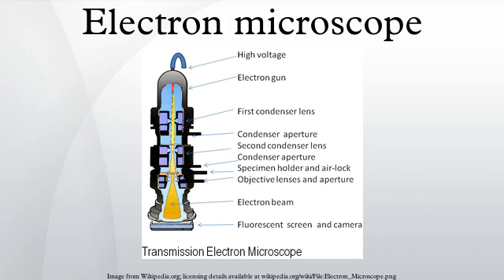The STEM's use of SEM-like beam rastering simplifies annular dark field imaging and other analytical techniques, but also means that image data is acquired in serial rather than in parallel fashion. Often TEM can be equipped with the scanning option, and then it can function both as TEM and STEM.